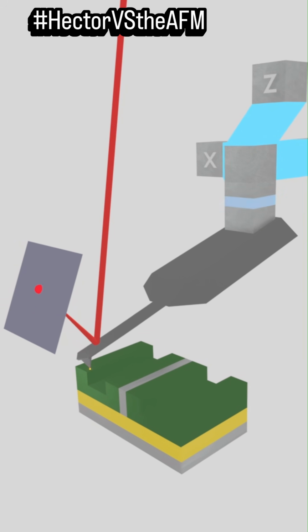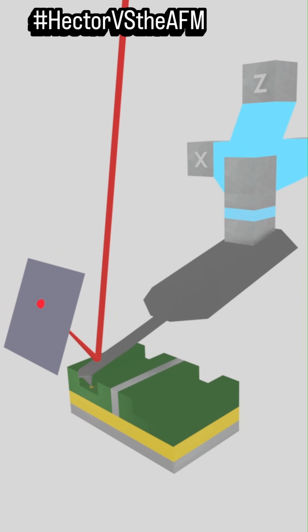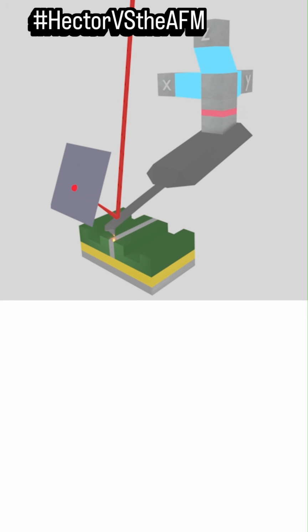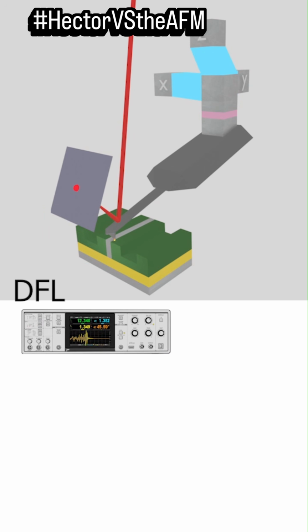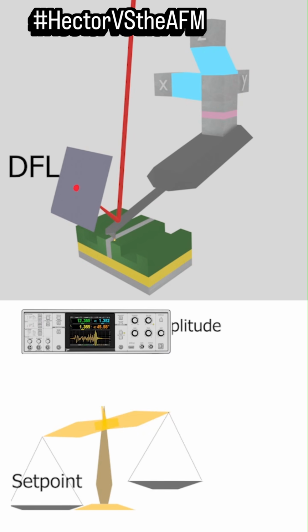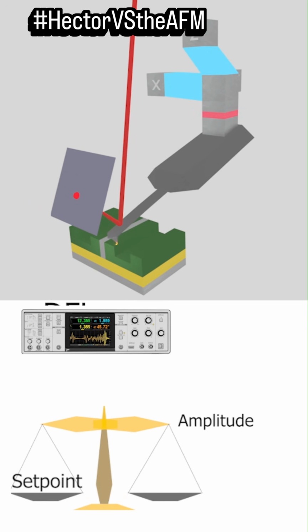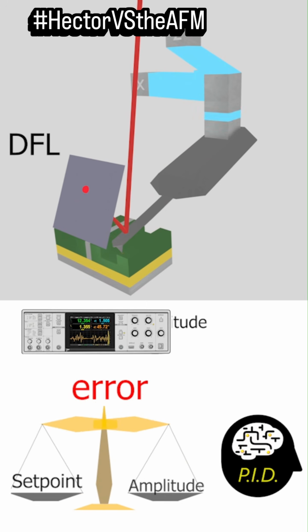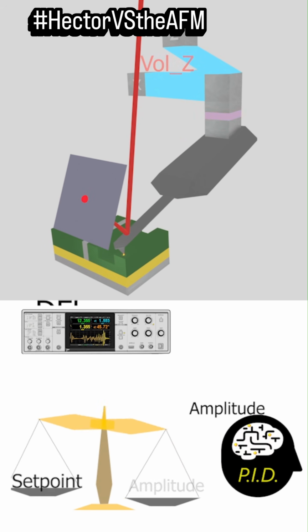During every tick of the AFM system, the photodetector sends the deflection signal down to the controller. Inside of the controller, a lock-in amplifier calculates the amplitude of the signal that happens at the resonant frequency. This amplitude is then compared against the reference amplitude to see how much the amplitude reduction is.